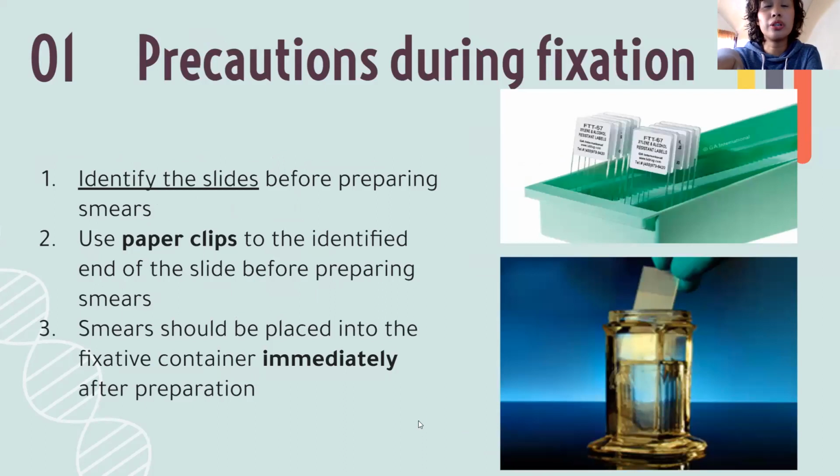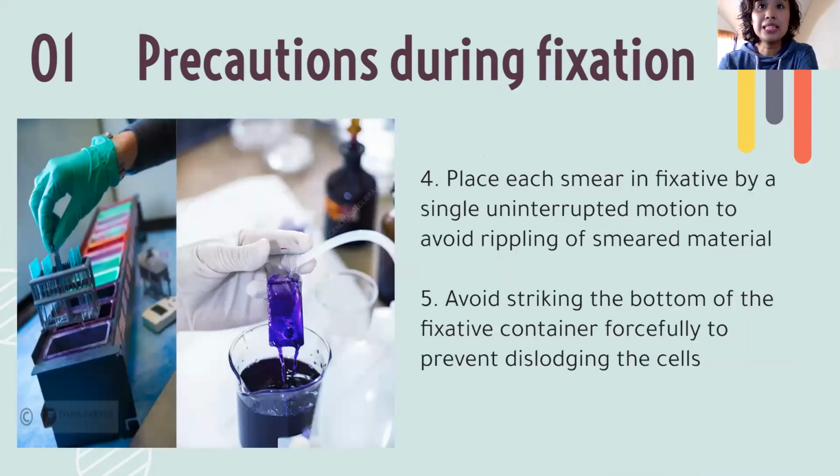So, precautions during fixation. So, first is identify your slides. Don't forget about that. But however, you could print it out or you could use your pens. Use paper clips to the identified end of the slide before preparing your smear. So, class, sa Pilipinas, yun. Paper clips or yung mga alligator clips, yung black na ginagamit natin. So, yun, so that you would know the end of the slide. Just a guide. Landmark, kumbaga, smear should be placed into the fixative container immediately after preparation, yes, to maintain the optimal form of the cells.